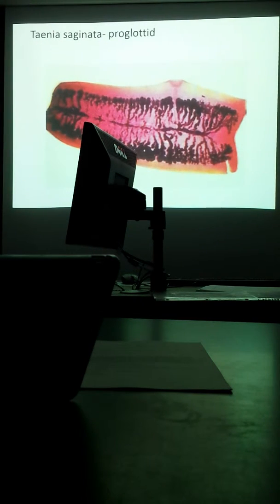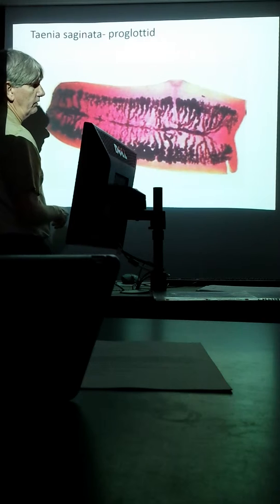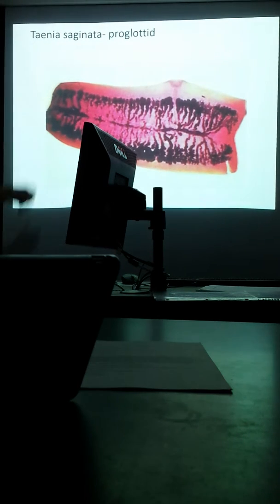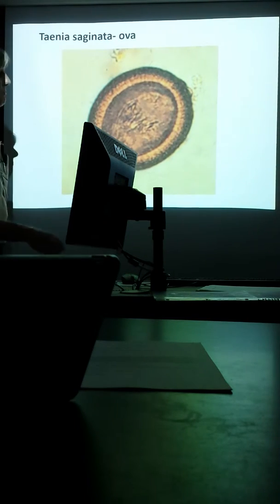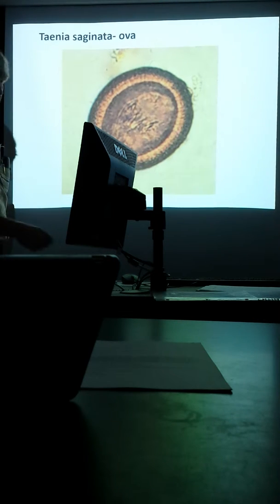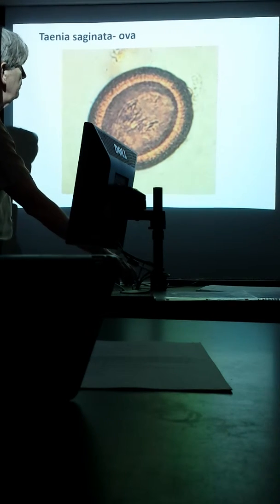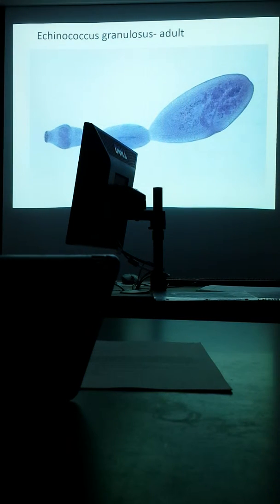And then for the proglottid, again, I use this picture right here. Mainly what we're seeing here, all of this is uterus type structure, and all of the testes parts kind of infused in the background. So anyway, tapeworm proglottid segment. Here's the tapeworm egg, so it's pretty circular. Got a big kind of rind looking deal around the periphery right there to protect it from the acidity of the stomach in the cattle.